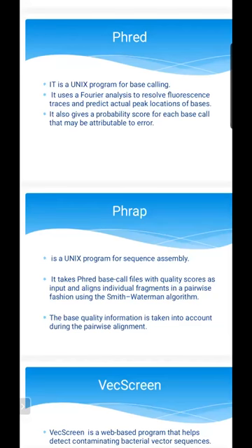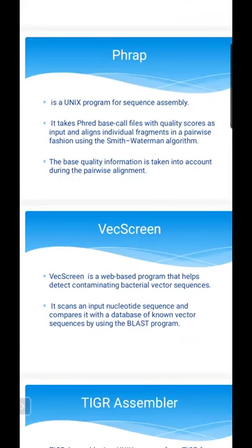After all the pairwise sequence similarities are identified, the program performs assembly by progressively merging sequence pairs with decreasing similarity scores while removing overlapped regions. Consensus sequences are derived just after joining all the overlapped reads.